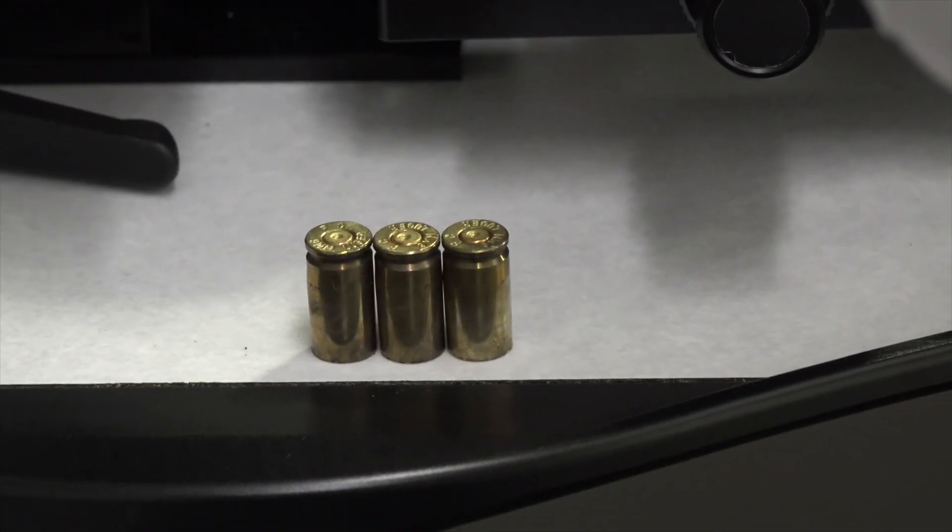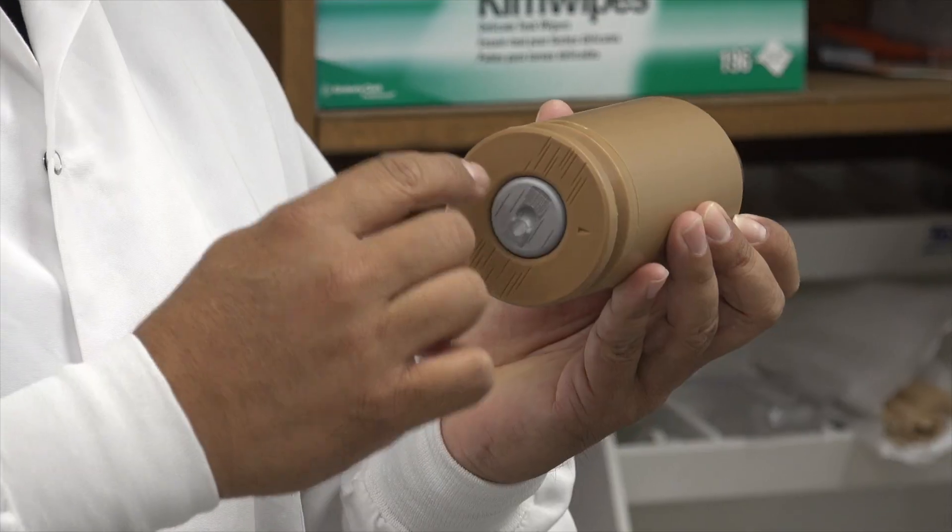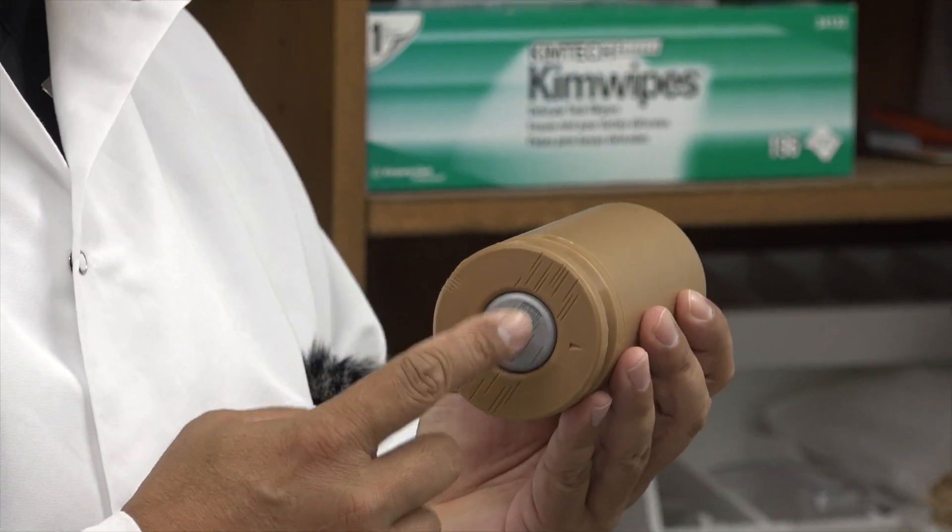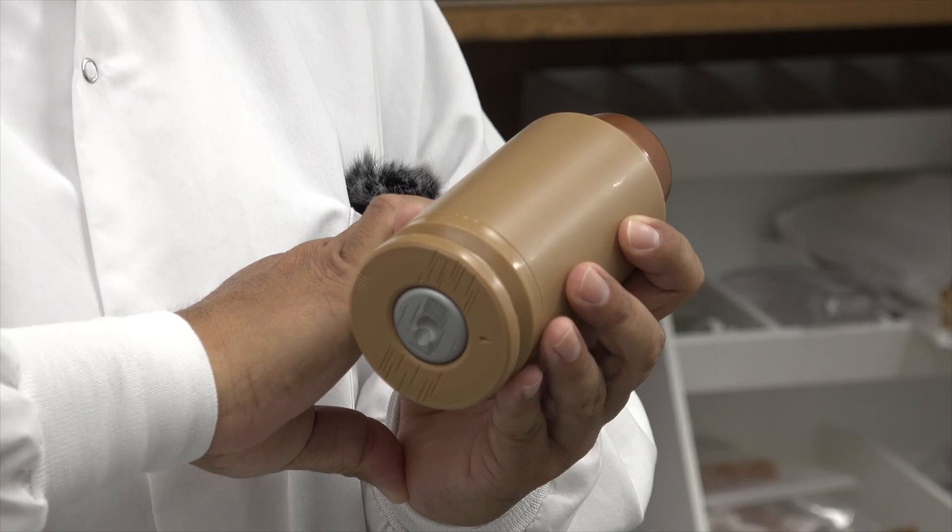So it should look like a lava rock or there's a granularity. Yes, we're looking for the metal particles in the primer components and that's what gets on the person's hands, the shooter's hands.